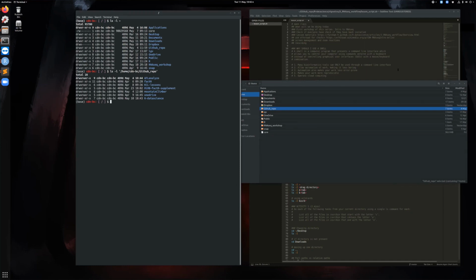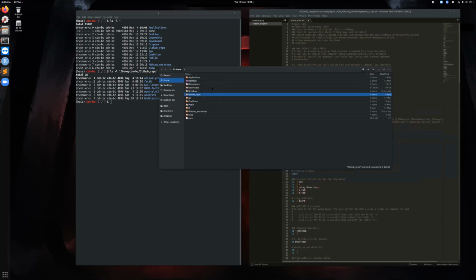You can do this on Mac, I'm very sure of that. On Windows, I don't think you can drag and drop, but there is an alternative. If you open up your File Explorer and there is a folder that you wish to paste into the terminal, you can, if I'm not mistaken, hold Shift and right click. There is an option that says copy path.